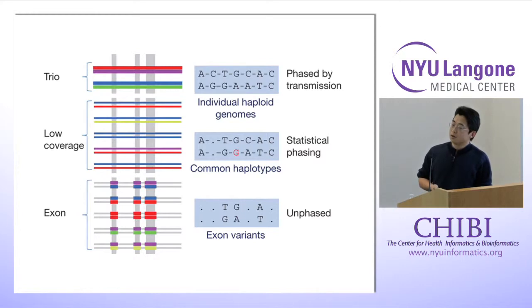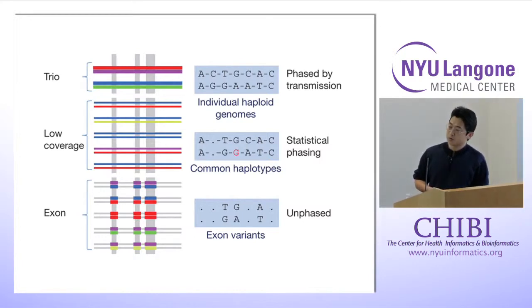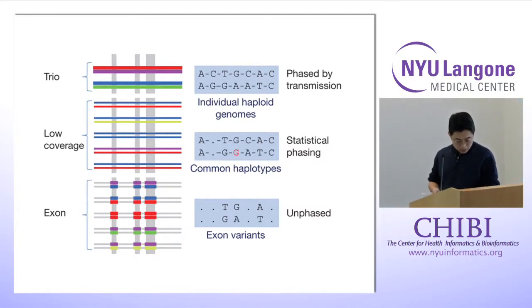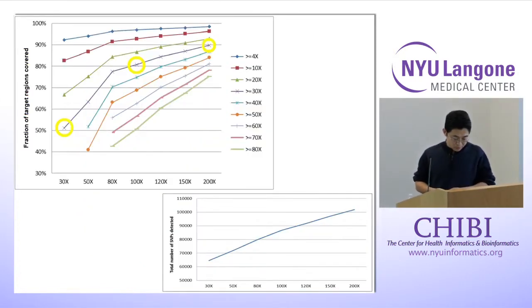Also, the quality is affected by the algorithms, the sampling algorithm and the alignment algorithm. Following this, I will talk about exon sequencing. For exon sequencing, the capturing, there are lots of techniques, different kits, to capture the exons, the coding part.